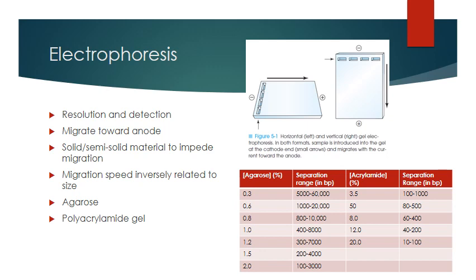And then the two things I just have down here, the agarose and the polyacrylamide gel, those allow us to really fine tune the sizes of the sequences that we want. And you can see agarose you would use for much larger sequences. When you're talking about really, really small sequences, you would use a polyacrylamide. It is not without precedent to first separate in an agarose and then separate again in a polyacrylamide, right? You'll get much more fine tuning because you can see the ranges in the agarose are much larger than the ranges in the polyacrylamide.